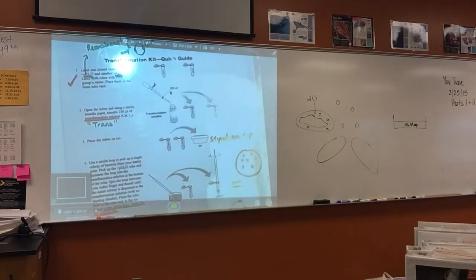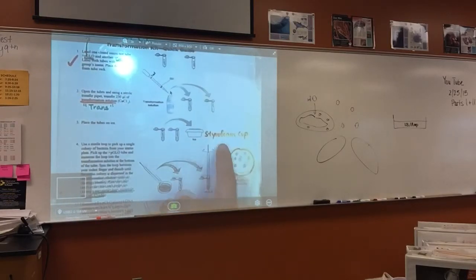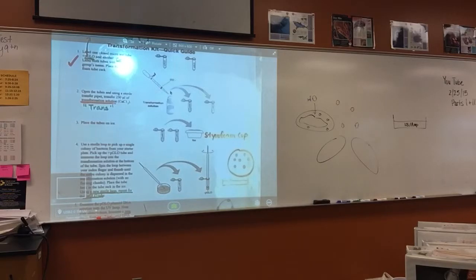All right, you'll have a styrofoam cup here for putting it on ice. It looks like a little tray. I'll have a container of ice in the sink here that you'll have to go and just scoop some ice out and put it in there. Notice that they made the thickness of the foam so that the bottoms of the test tubes stick out. That's where your liquid is, so that it can stick in the ice. You can also take them out, they'll be closed, and bury them in the ice too. That might be even better.